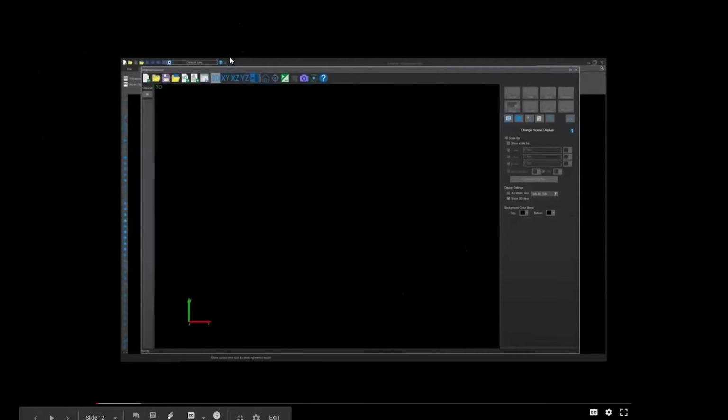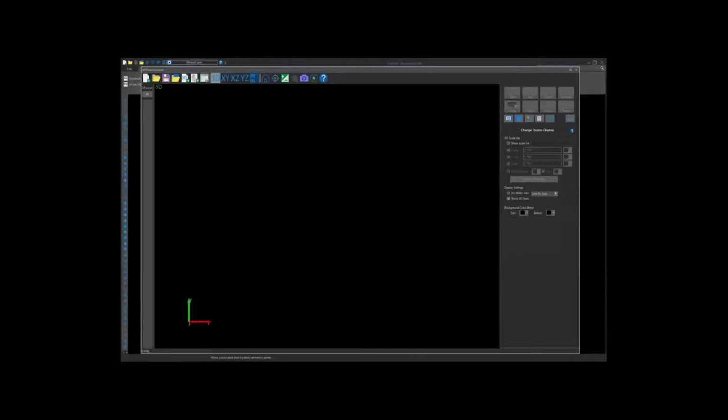So here you'll see I have the Neurolucida 360 program window open, and I'm going to use the data file that Aiden just showed in that last video to demonstrate how you can take existing data, or maybe data that's been converted from another segmentation source into MBF XML, and add these FAIR annotations. So using SciCrunch and the vocabulary terms to make each individual element more FAIR.